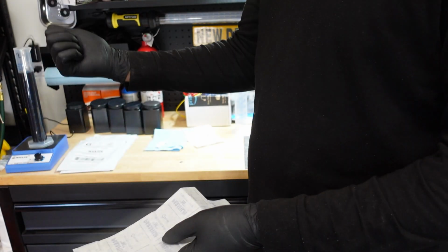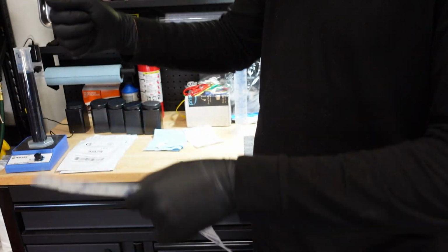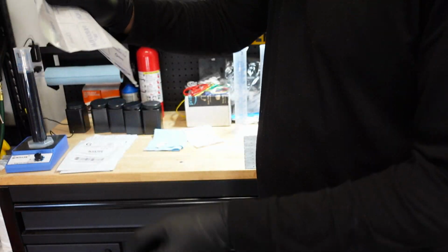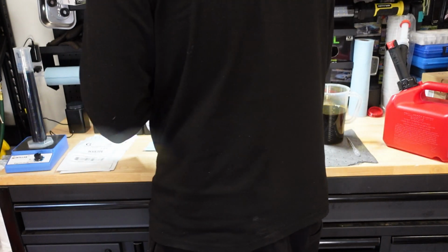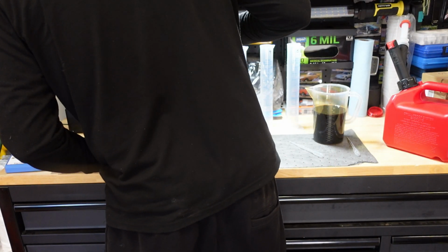When I invert stuff like the specialty bag, I probably want to do it 3 times 3, which is 9. So I'll probably invert it 9 good times, and then we'll move on to the next container here. So let's do that.